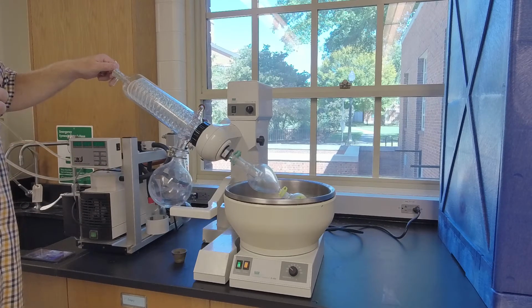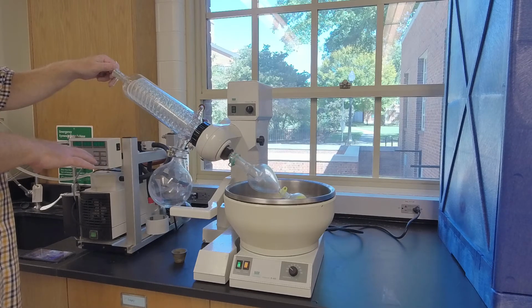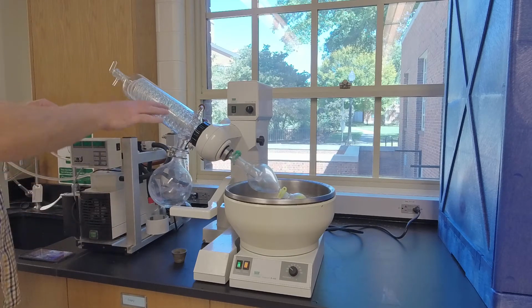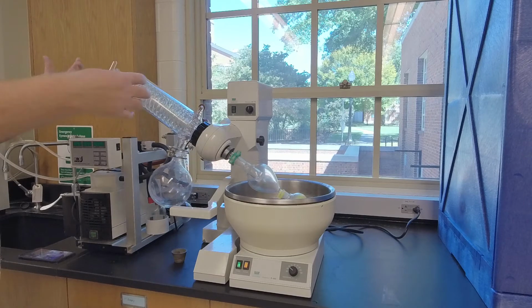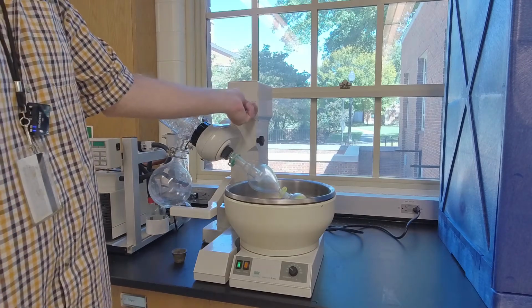A TA or me will help you with the rotovap. We won't turn this machine off until the end of the day. But let's assume you're doing this in a research lab. You want to turn all this off after you've released the vacuum. Because again, if you shut this down with this still under vacuum, you're going to have competing vacuums and you can damage the equipment.